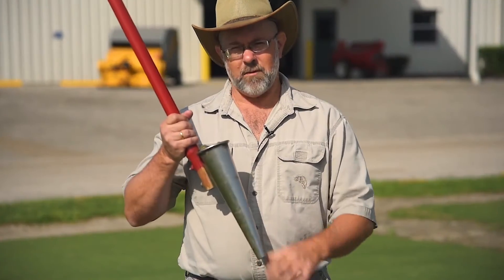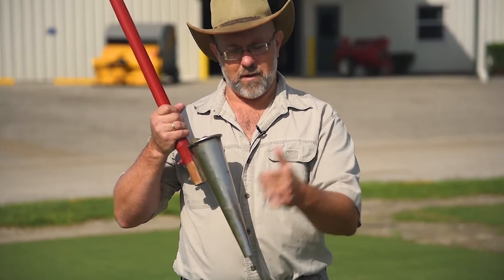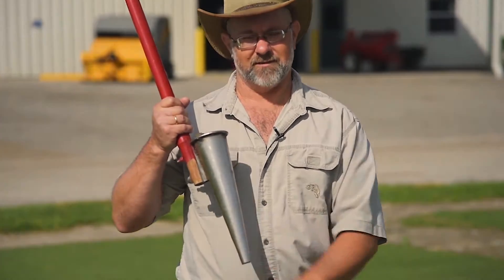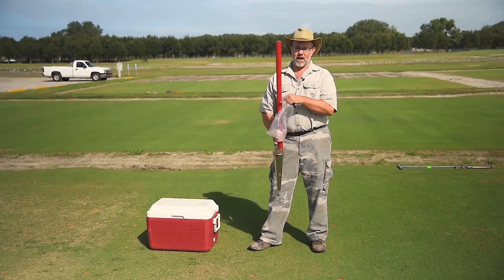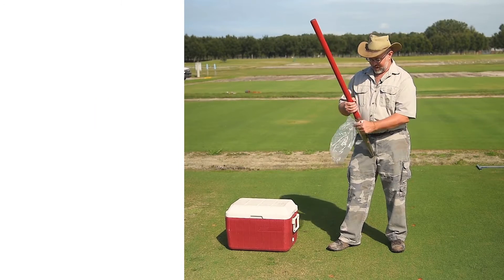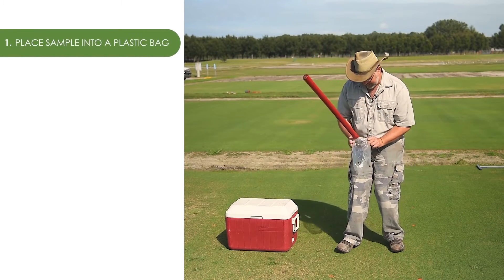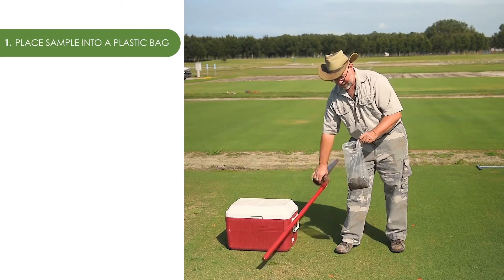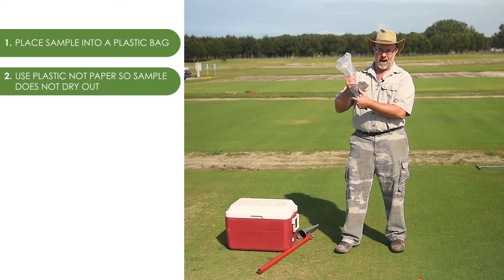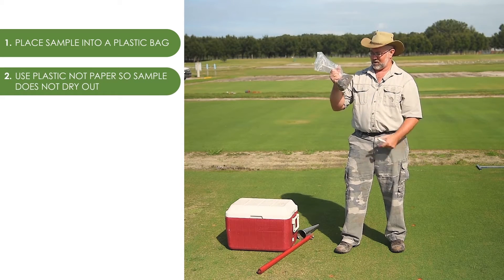Here we have our nematode sample from this green that's representative, composed of 16 individual cores. Now that we have our nematode sample, we want to send it into a lab. We want to put your sample into a plastic bag. We want to use plastic and not paper so that the sample doesn't dry out and we end up with dried up, shriveled up nematodes.